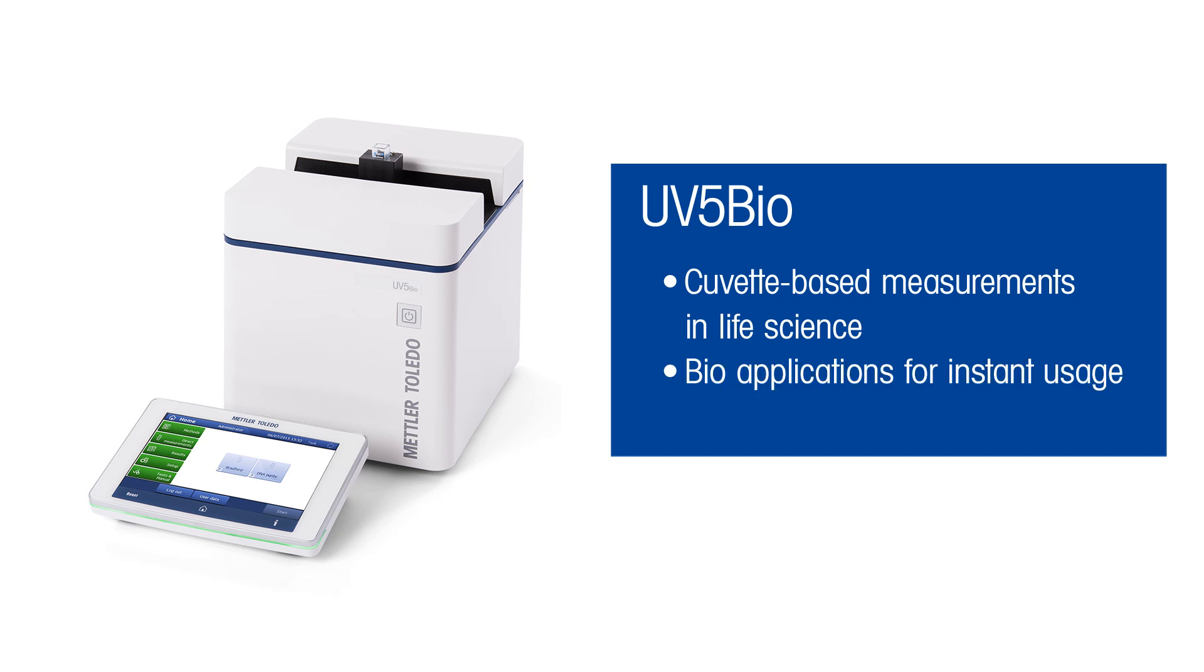It contains ready-to-use bio applications, and application-specific accessories are also available.